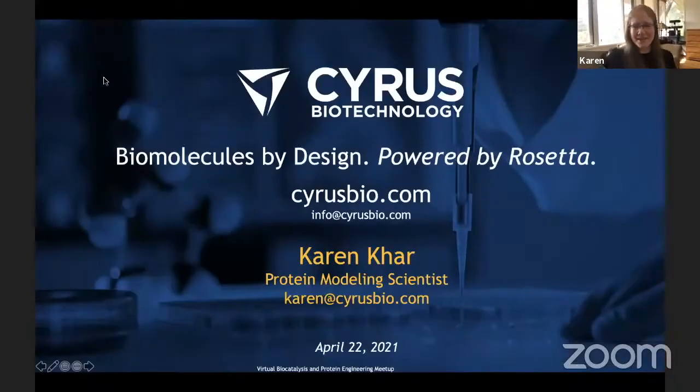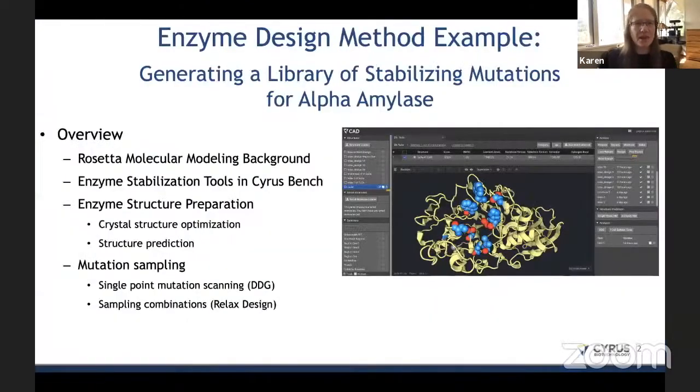I'm excited to talk a little bit. This is a very different talk than the last three because I'm focusing on the protein modeling, the protein design parts of it. As Allison mentioned, I got my PhD in a Rosetta lab, so I learned how to use Rosetta to do some very specific protocols for protein modeling. But today I'm going to be describing an enzyme design method example using the Rosetta molecular modeling suite.